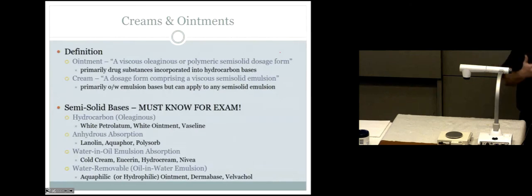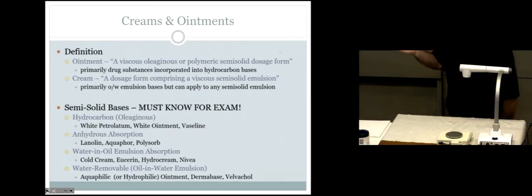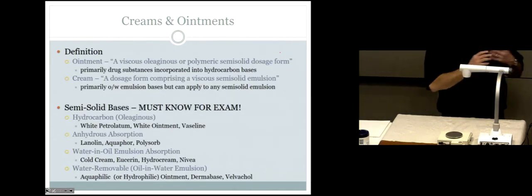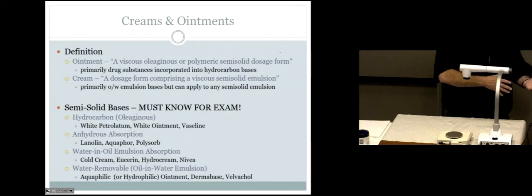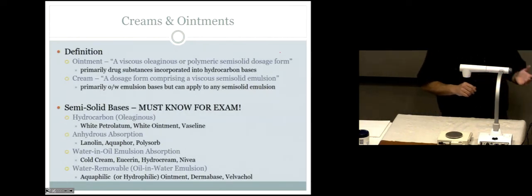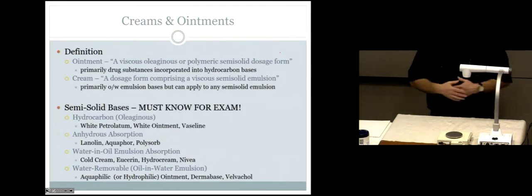The reason there is anhydrous absorption is because the petrolatum or oleaginous bases are good, but are problematic for incorporating drugs. Anhydrous absorption bases are the same kind of base, but now we can incorporate more drugs. You have to know all of them, but the one that's really helpful to remember is Aquaphor. Have you ever heard of Aquaphor? What does aqua stand for? Does anyone speak Spanish? Water, right? So is there water in Aquaphor?